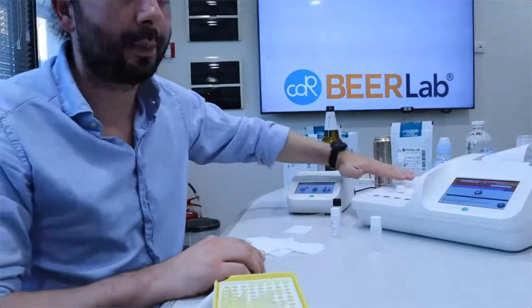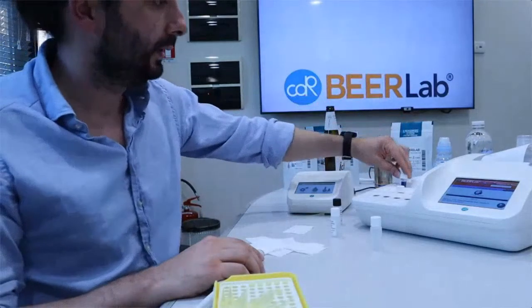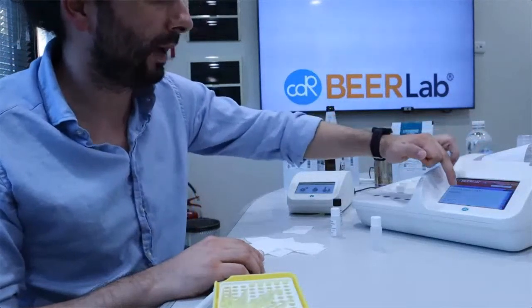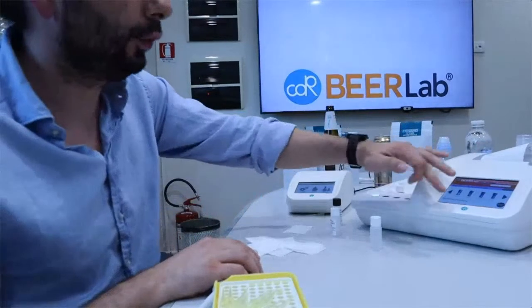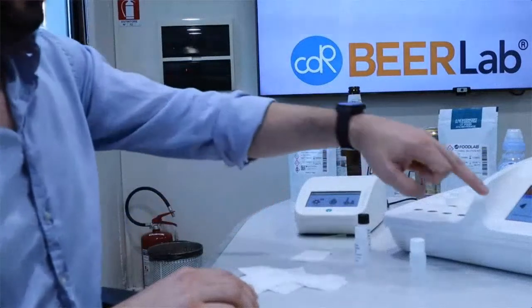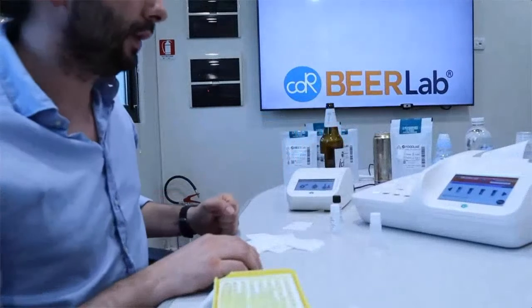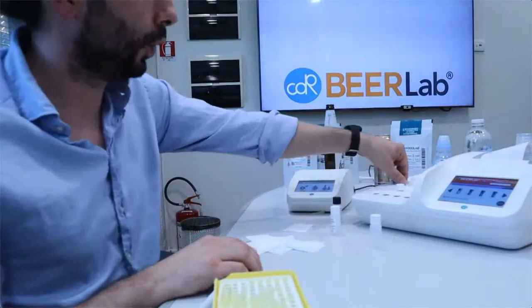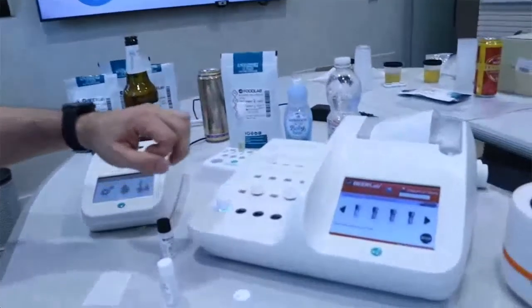We have already prepared the cuvettes of magnesium here, so we can go back to magnesium, and here you have on the screen the magnesium analysis. On the screen is written that in this case we have just to read the cuvette. So we take the first cuvette, cuvette 1, and we read it.